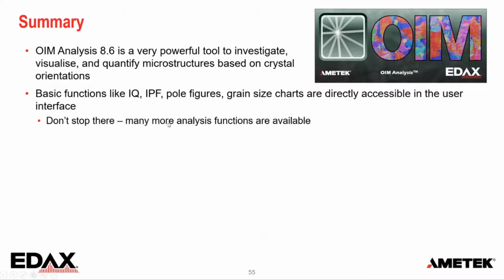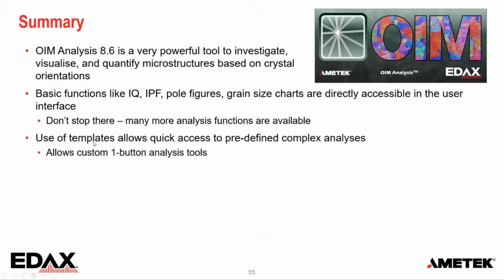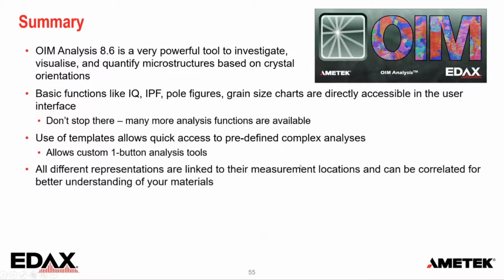There's many more analysis functions, comparative functions, interactive analysis that you can do. You can make your templates, you can make your own one-button tools, and all the different displays, maps, plots, charts are linked to their original measurement point, and you can correlate them and really work at understanding your materials.